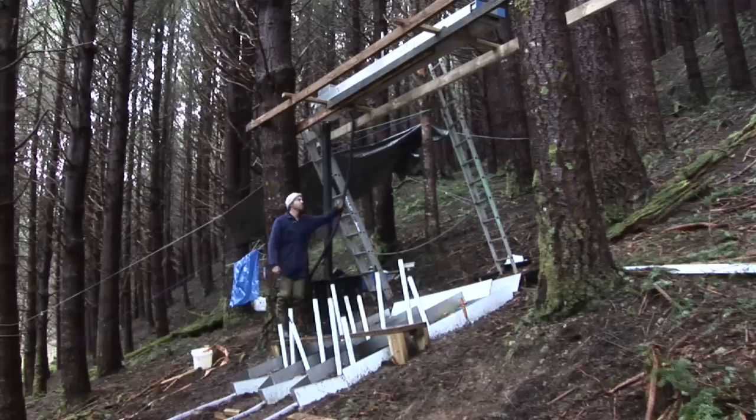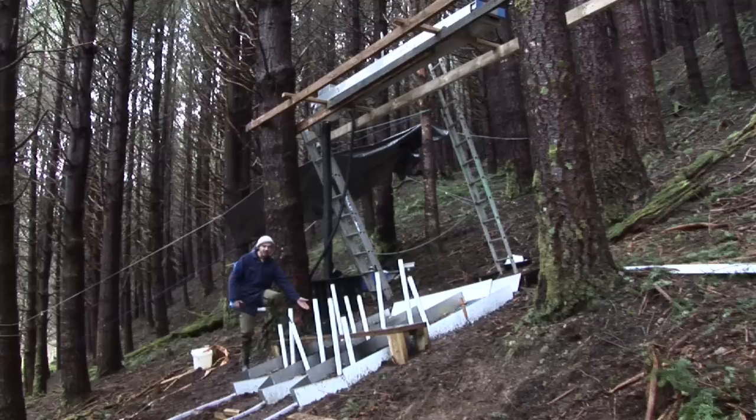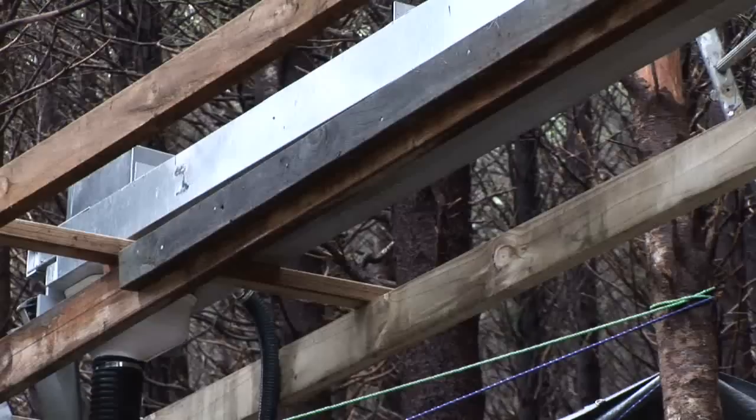So here we have the rainfall simulator going. It's coming out and it oscillates from side to side. Gives about 15 millimetres an hour. We have a small rain gauge there that's just going to quantify how much rain we're applying, and that's running all the time. So everything seems to be working well. We've got the rainfall hitting the baits. We'll come back in 2 hours and sample the water.